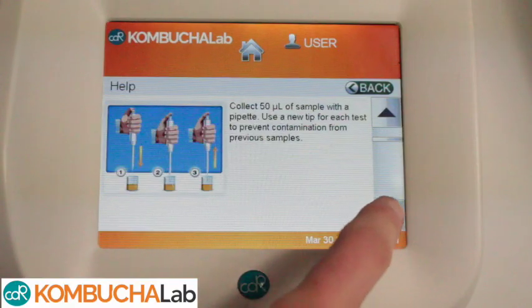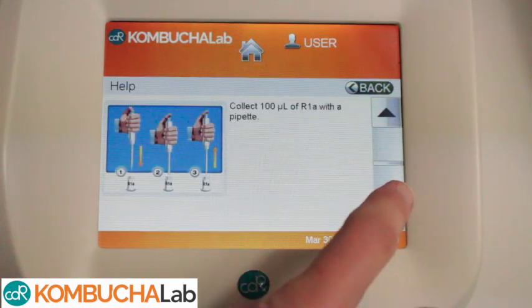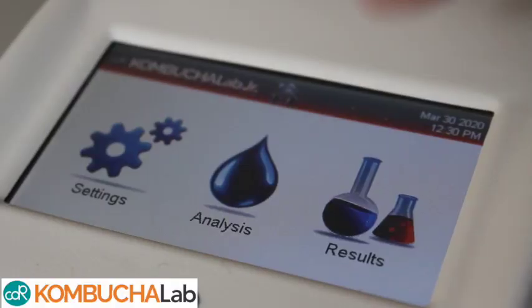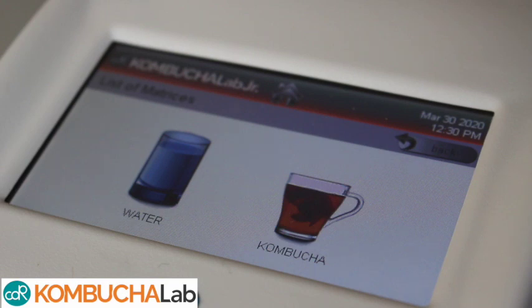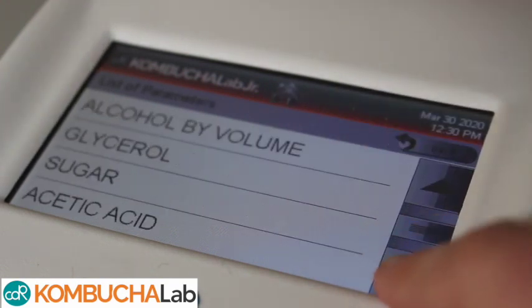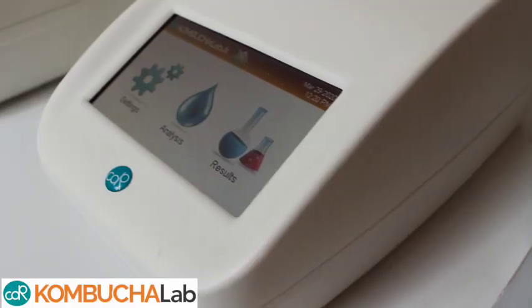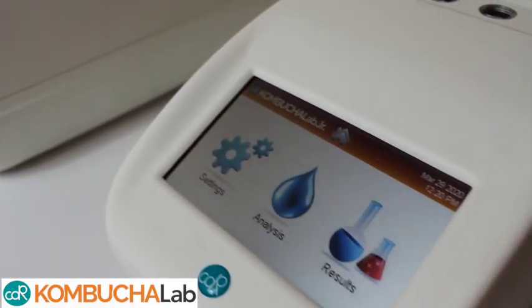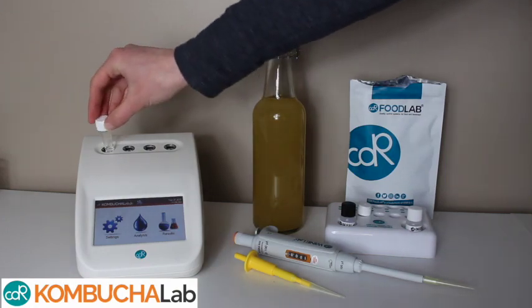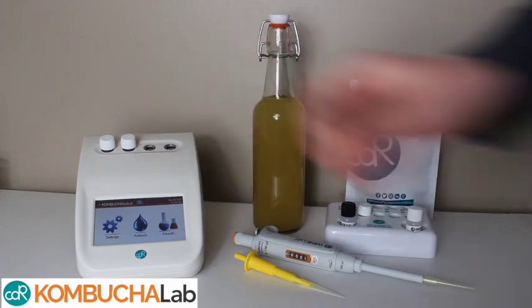The analyzers come pre-calibrated and ready to use with a user-friendly touchscreen interface. The CDR Kombucha Lab is able to perform a number of analyses on your kombucha and even water. There are two different Kombucha Lab models: the Kombucha Lab Touch and the Kombucha Lab Junior. Both use innovative technology and software to enable you to get reliable results within minutes without the need of a scientific background.